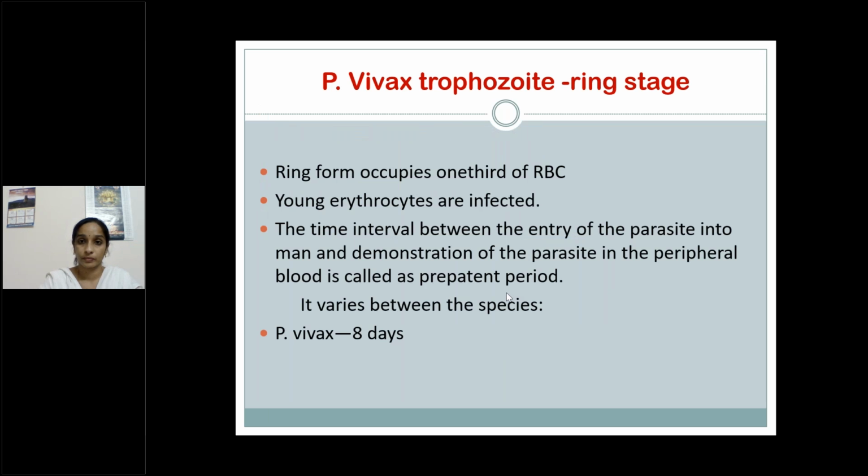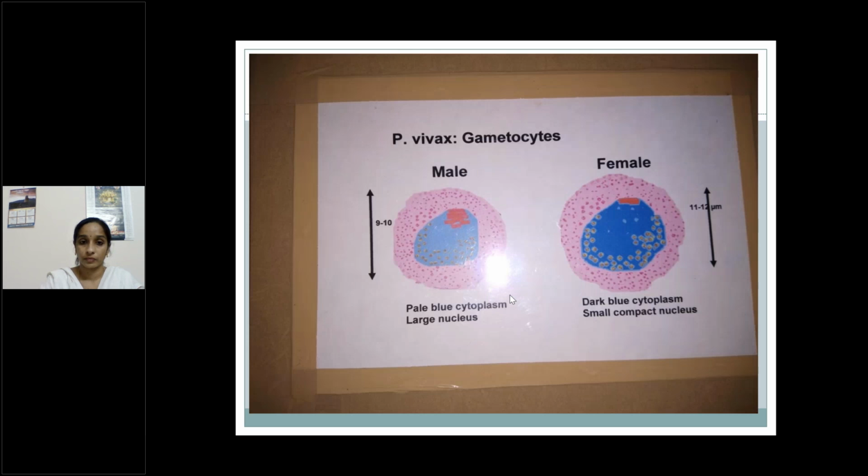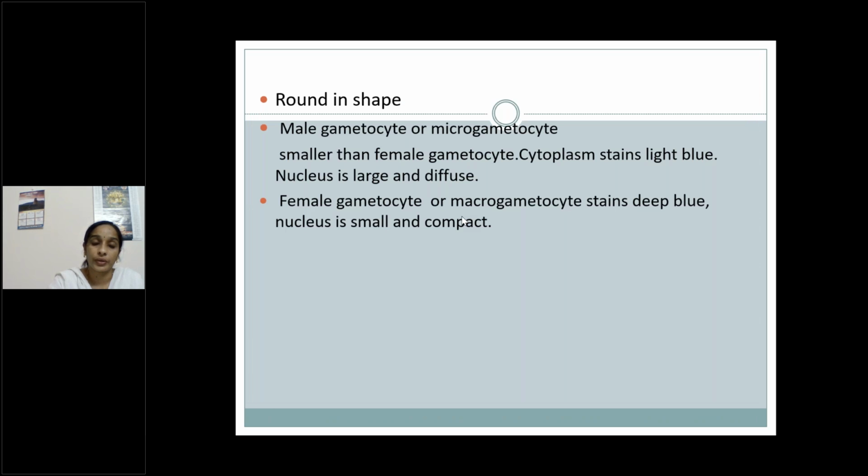Next, on the next page, page number 122, after the seventh slide, that is Trichinella spiralis, you put the heading for the eighth one, Plasmodium vivax gametocytes. Note down the point: round in shape.